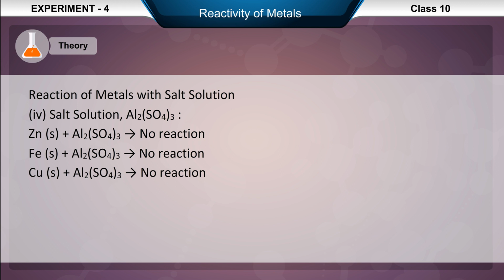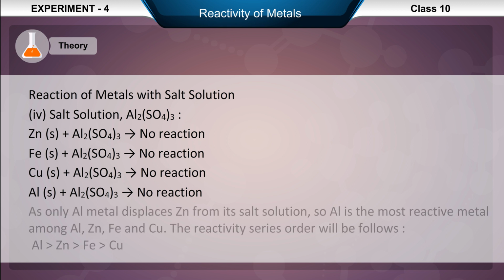Cu in solid state plus Al2(SO4)3 results in no reaction. Al in solid state plus Al2(SO4)3 results in no reaction.